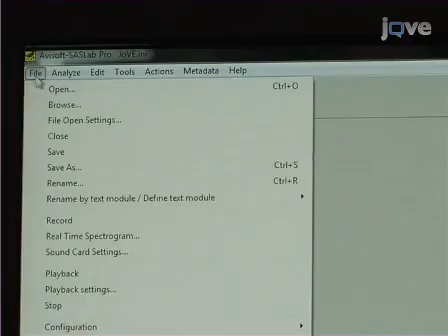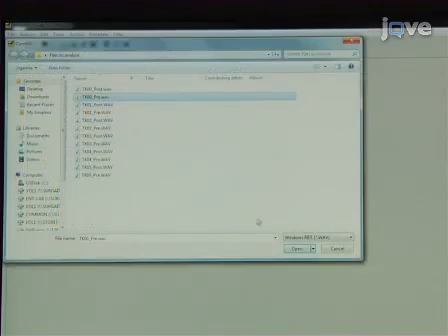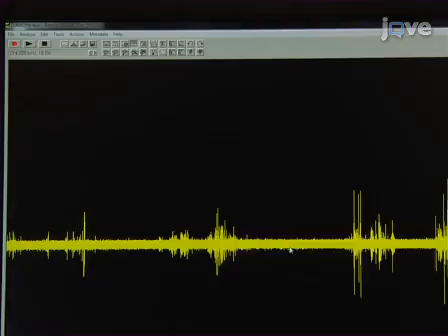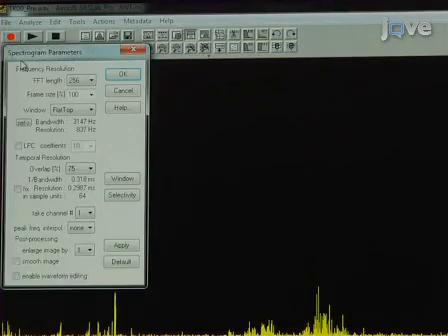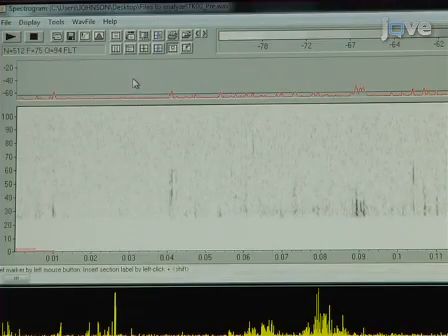To determine the noise threshold needed to use the automatic element detection feature of SASLab Pro, open a sound file and create a spectrogram. Set the FFT length to 512 with a 75% frame size and a temporal overlap of 93.75%. Enable waveform editing so that noise erased from the spectrogram can be removed from the waveform.